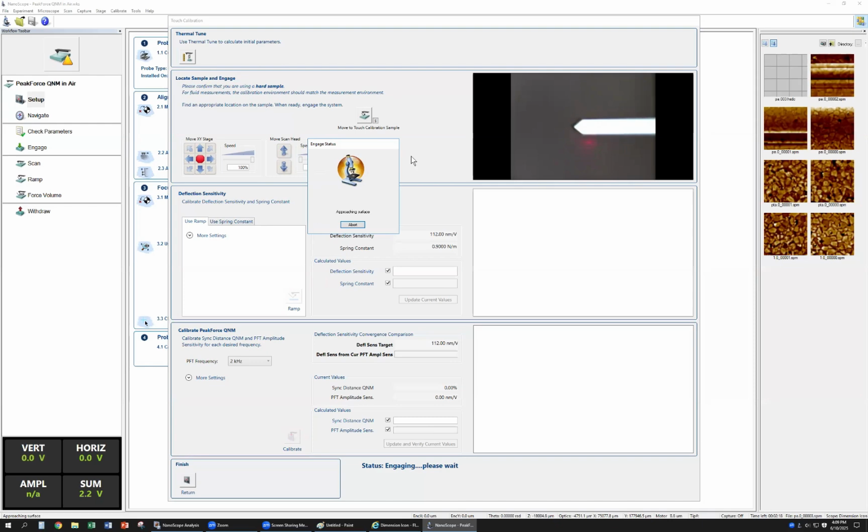So normally we put the laser a little bit inside, not on the very top, because the top is narrow. Then the laser reflection will not be very good. That's why we put the laser around this spot.